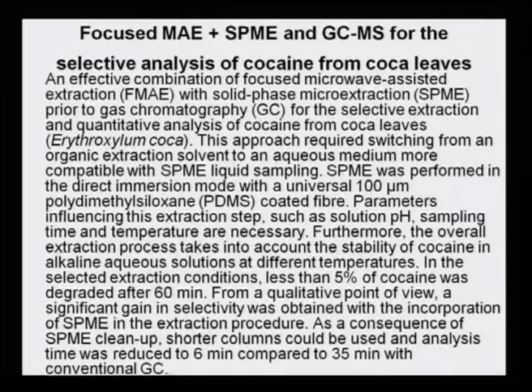Now, another method uses focused microwave-assisted extraction, MAE, and SPME methods of extraction connected to GCMS, which definitely has a more advantageous situation.